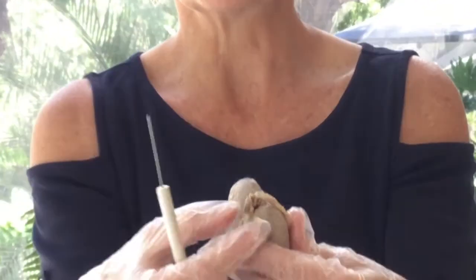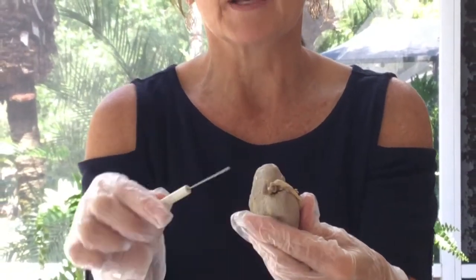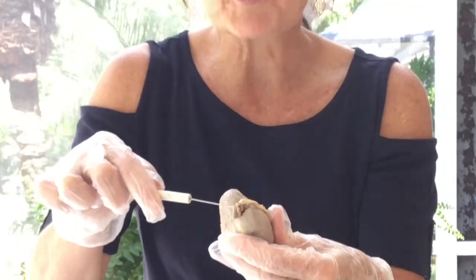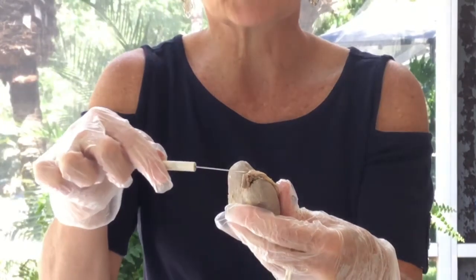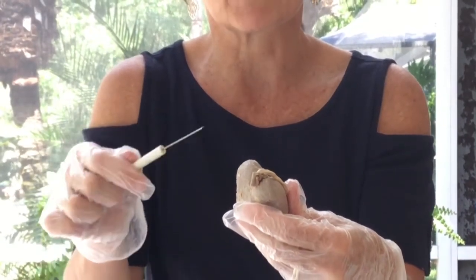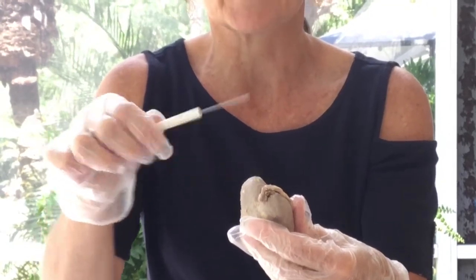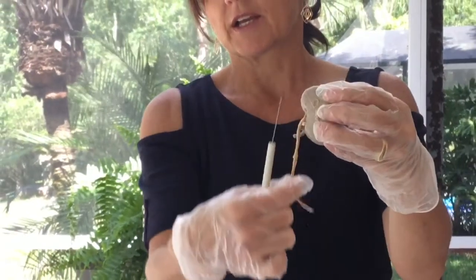The stiff one feels like a stiff rubber band. That is the artery. The arteries are stiffer. This little soft one is very squishy. That is the renal vein. They're always a little less stiff than the arteries. That one has been cut a little shorter. Doesn't mean it's shorter, it's just cut here. And then the ureter is this floppy looking tube that's coming out this side.